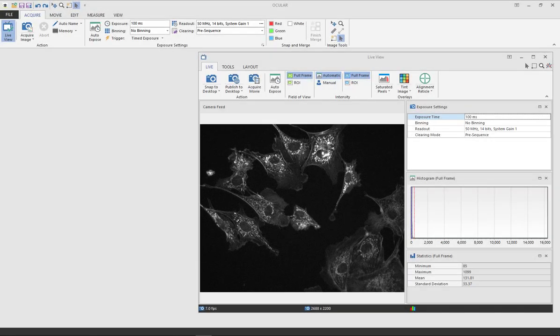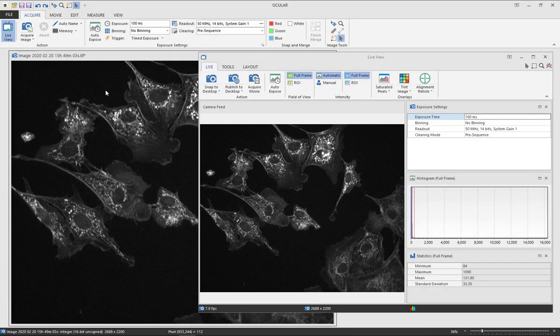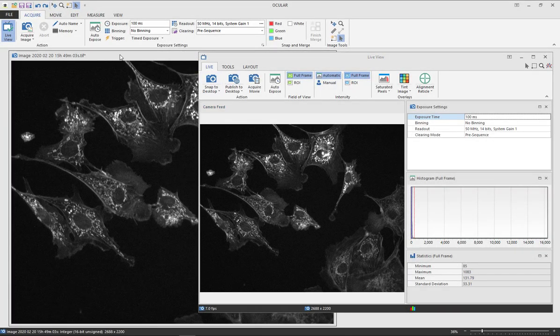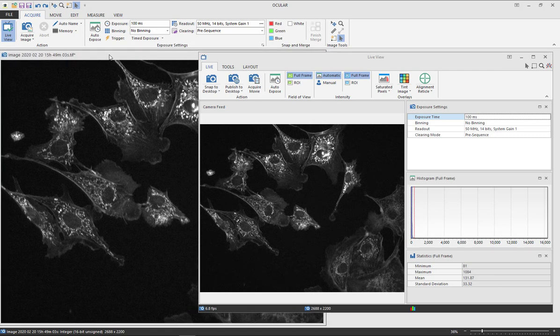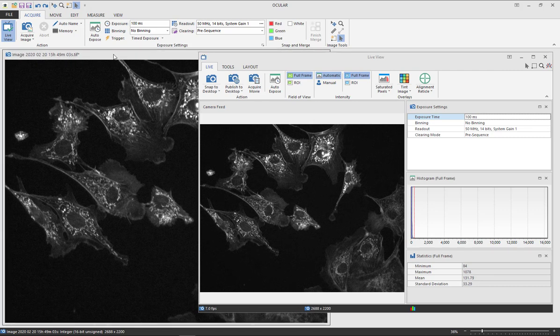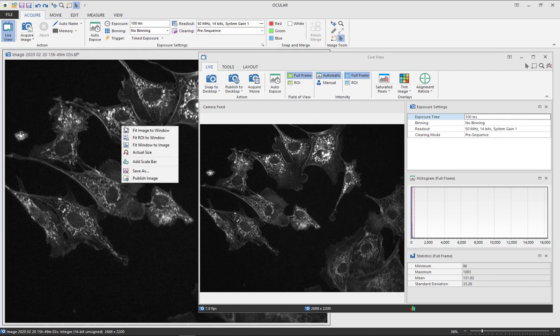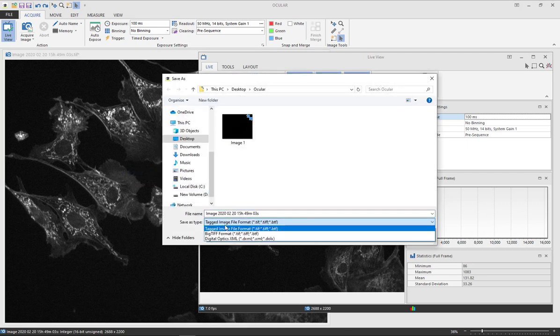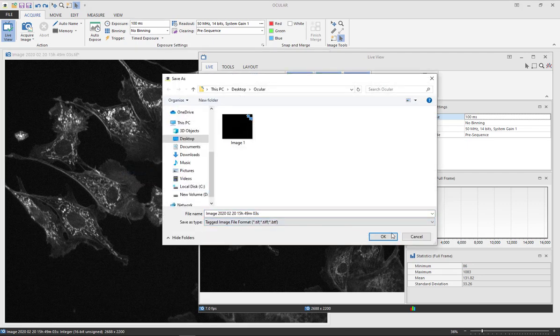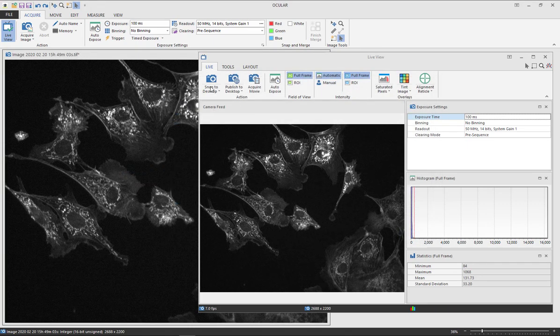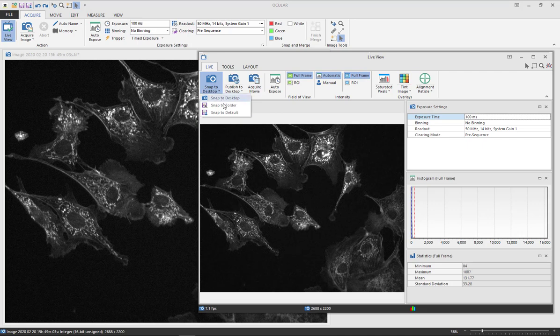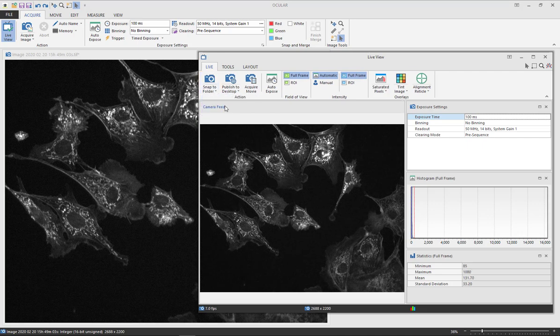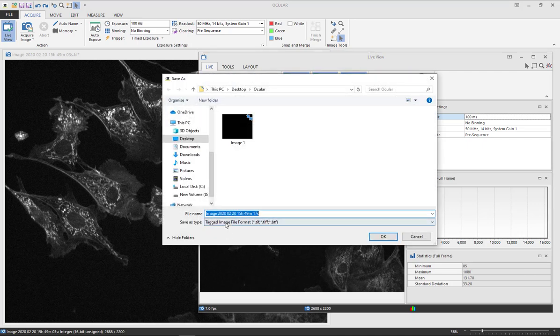To snap an image select snap to desktop. This will move your image to the desktop window. Here you can save to a selected folder in the default TIFF file format. There is also the option to snap directly to a folder, again to save in a TIFF file format.